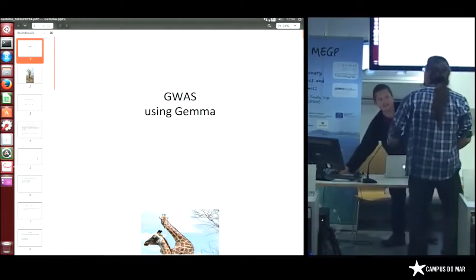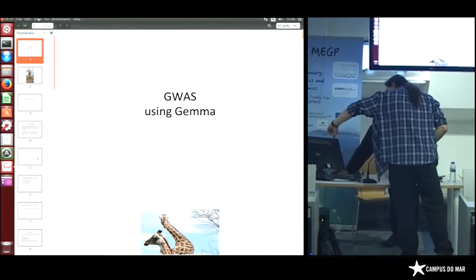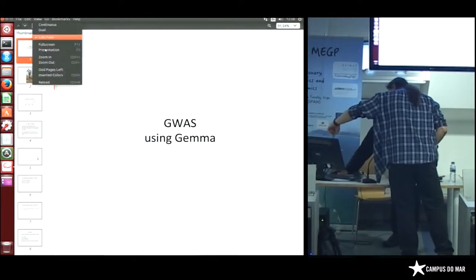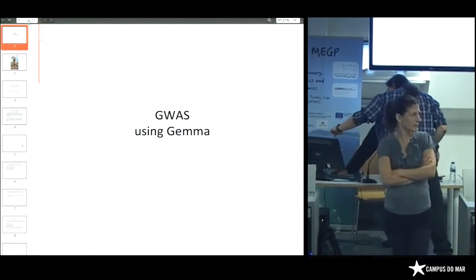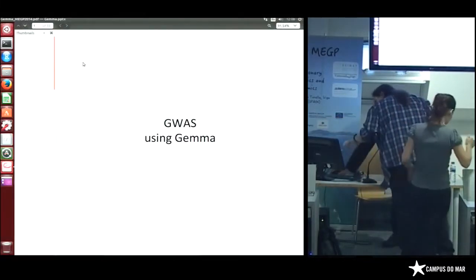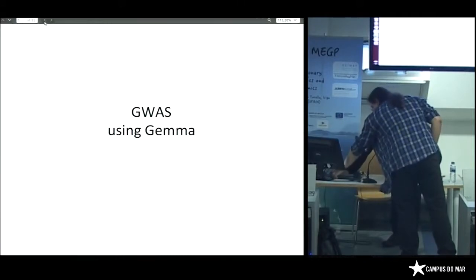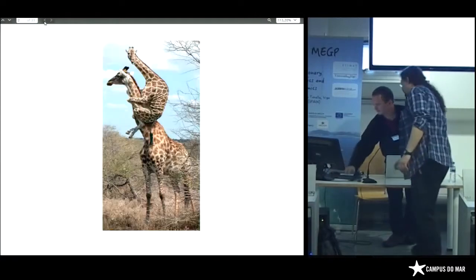The menu will be shown if you put the view. Yeah, it's full screen. Remove the continuous, otherwise it will be continuous, and then just full screen or F11. And if you want to remove that, you need to go out and close this before going full screen. Now to go full screen with F. Okay. And to pass, I think that is it.